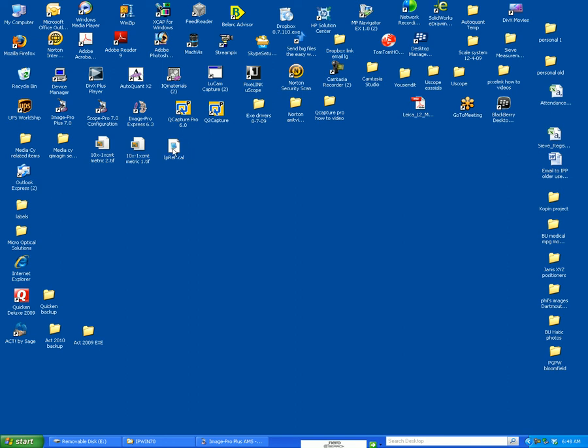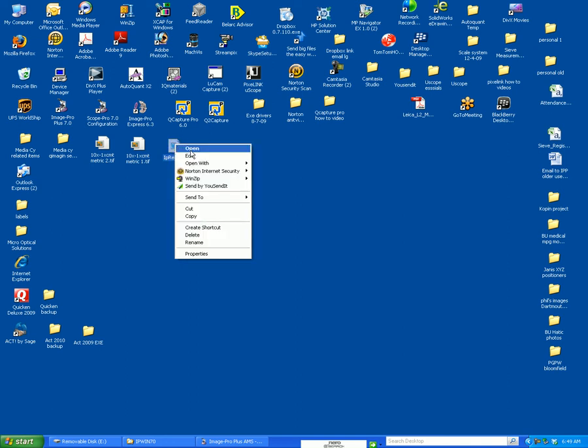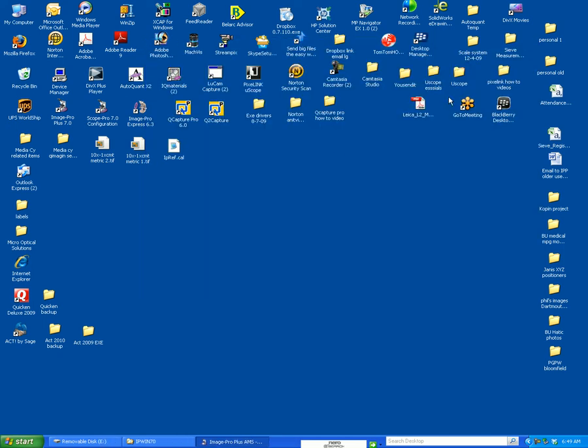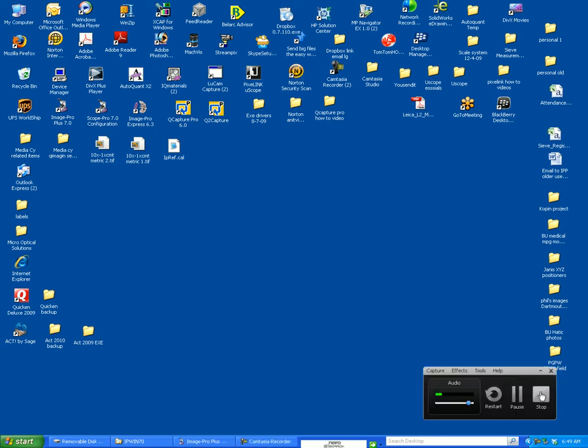The reason I've done this, if you open this, you'll see that it has all the calibration values in there. If ever your system crashes, you want to copy this into the root directory of either ImagePro or QCapture Pro and that will save your calibrations in the future.